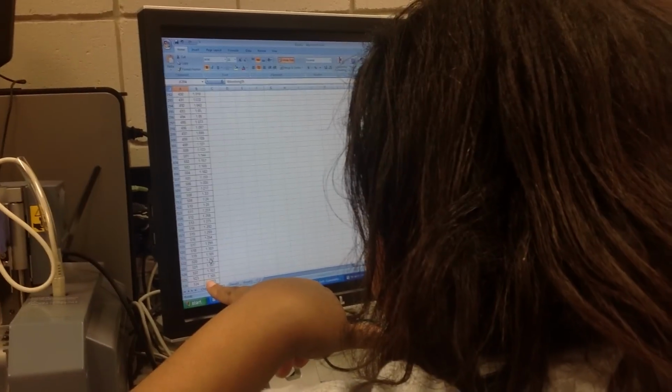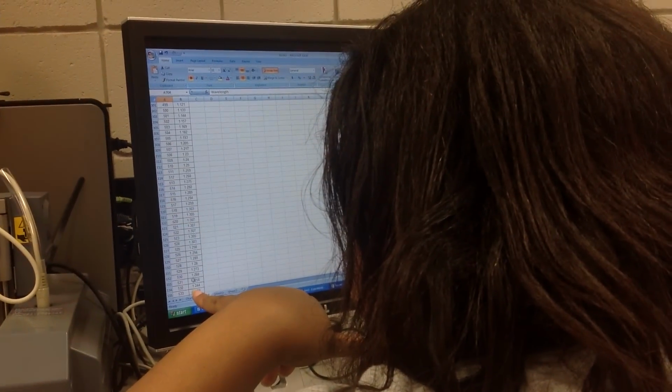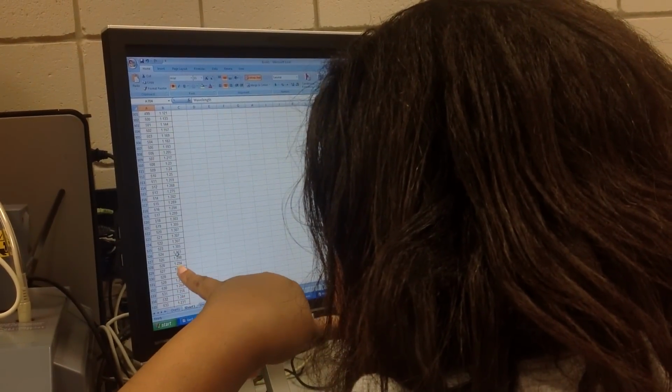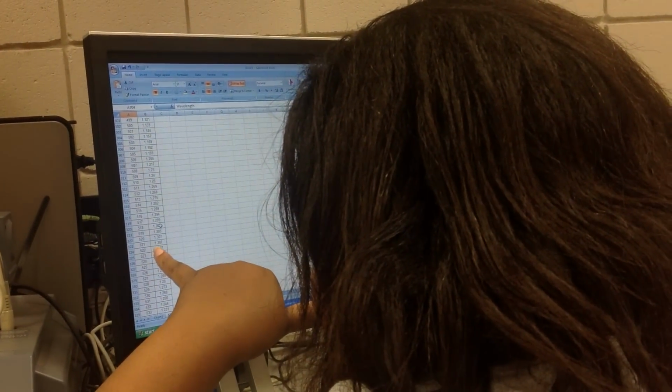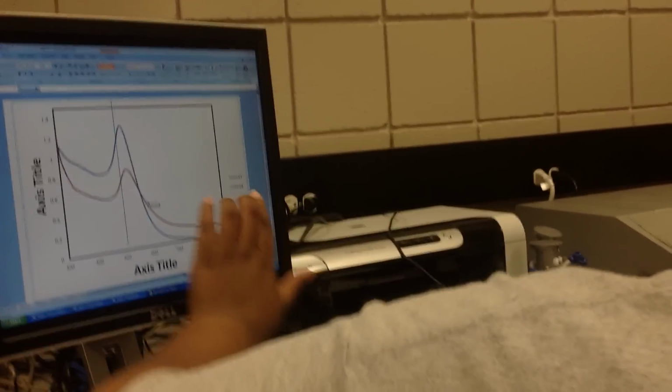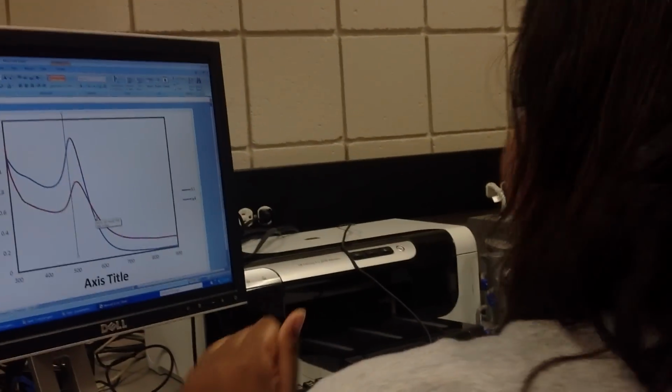So we see that the highest value here looks to be about 520. So it might not necessarily look like it. Sometimes you have to stretch it out even further. But that's that, and you can stack them up. You can have all your things to compare.